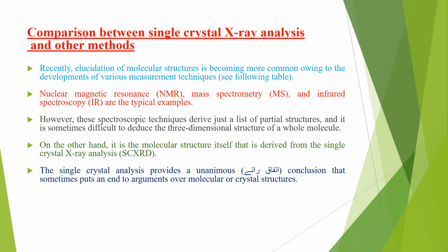On the other hand, when we use X-ray diffraction technique, it is the molecular structure itself that is derived from the single crystal X-ray analysis. The single crystal analysis provides an unanimous conclusion that sometimes puts an end to argument over molecular or crystal structure.